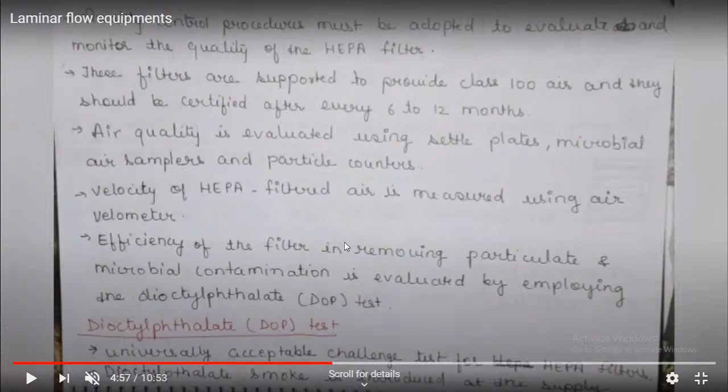The velocity of the HEPA filter air is also measured using an air velometer, and the efficiency of the filter in removing particulate and microbial contamination is evaluated by employing the dioctyl phthalate test, that is the DOP test. So these are some evaluation criteria for whether your HEPA filter is working to standard or not for the clean area. And mostly in the clean area, the clean air should pass through the HEPA filter.